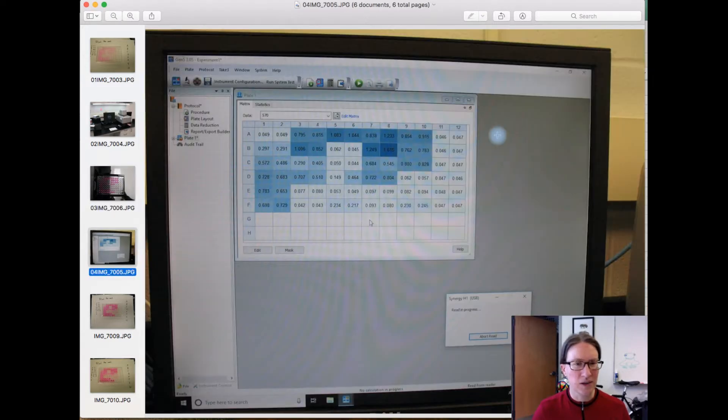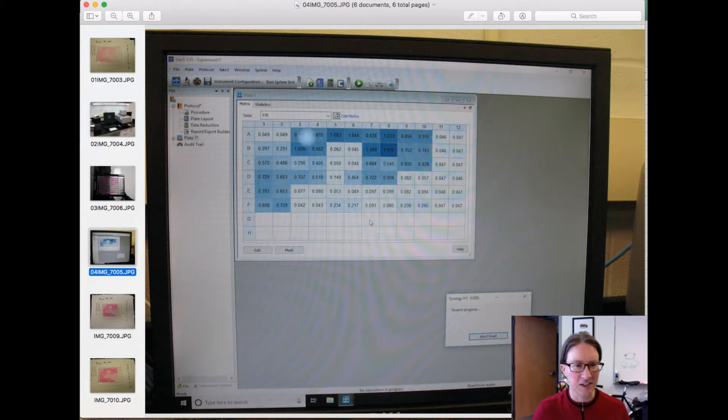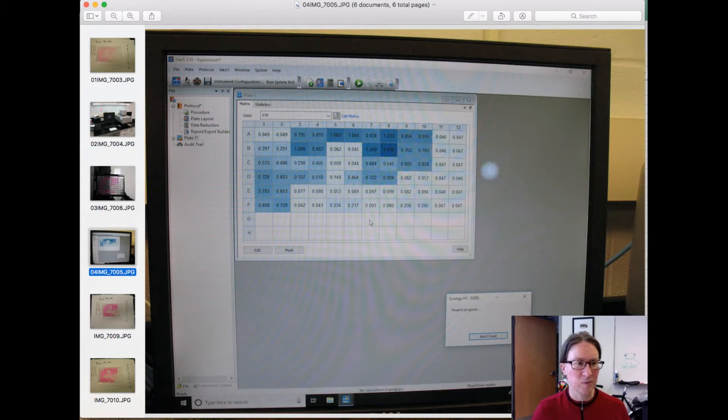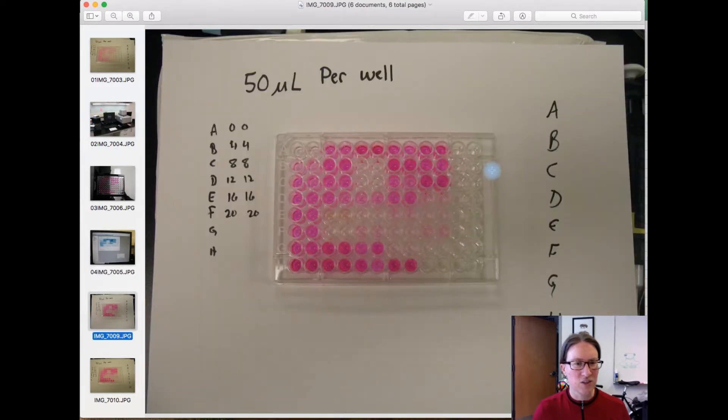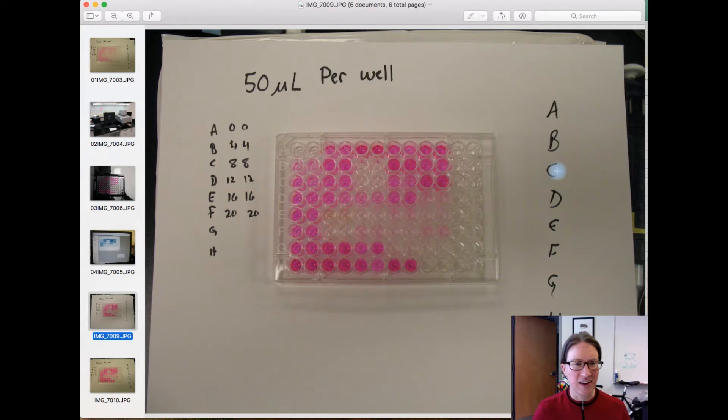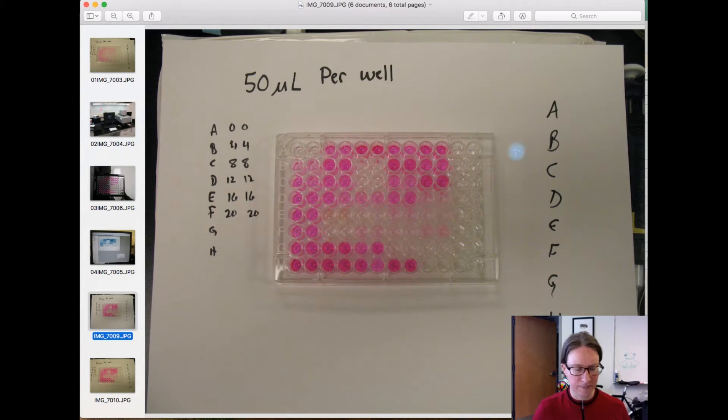And here's what the output actually looks like from the software that will read the plate, so it's nicely color coded, and then this generates a file that can be exported to Excel. And just so you can see it for posterity, here's what the plate looked like after it came out of microplate reader, so clearly there's been more development across many of the samples here.